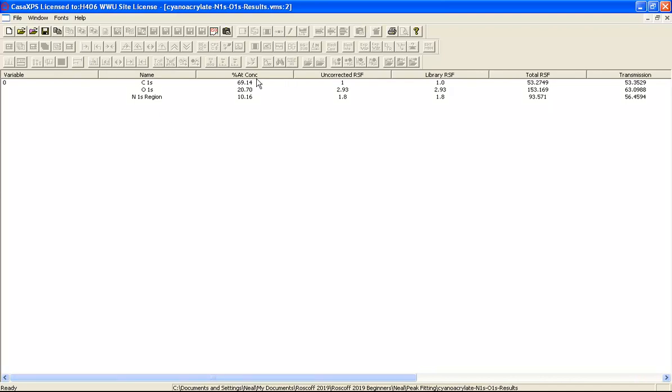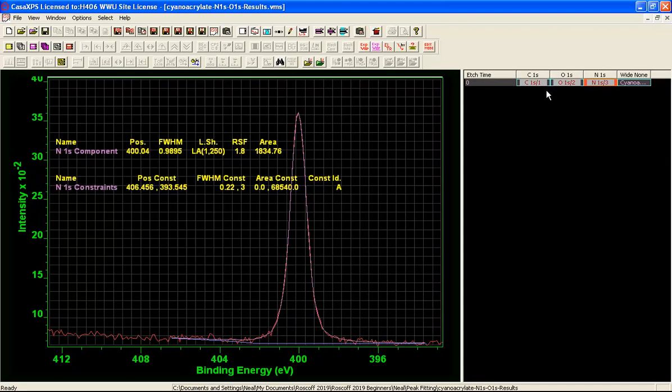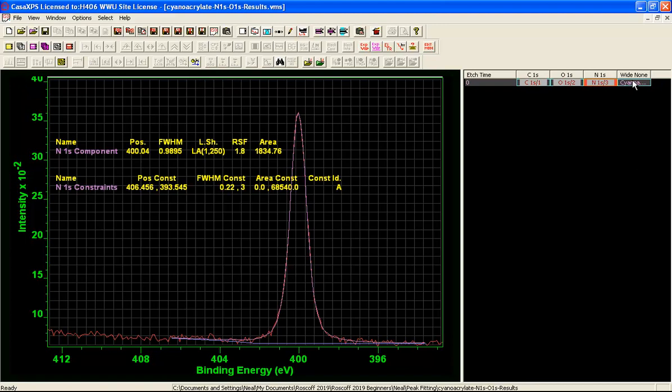It is giving us the information now from the selected VAMAS blocks here. And we are getting a similar story from the high resolution data as we did from the survey data. That there is slightly more carbon than we would have expected for the material in question.